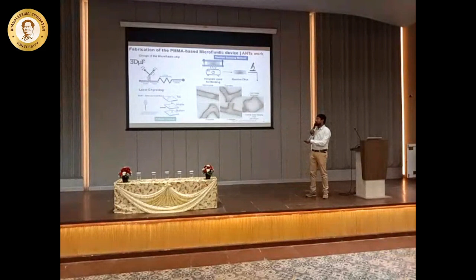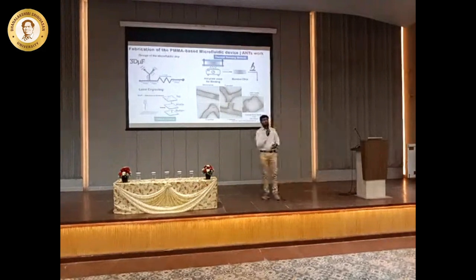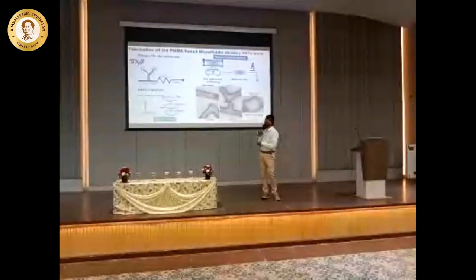So the center layer will have the design with which we want to create, and the top channel and the bottom channel will fuse. The top channel will have all these inlets, and the bottom channel will be the liquid that should not go out of these microchannels, right? So we need to seal it. So we have a different mechanism with which we seal this thing.